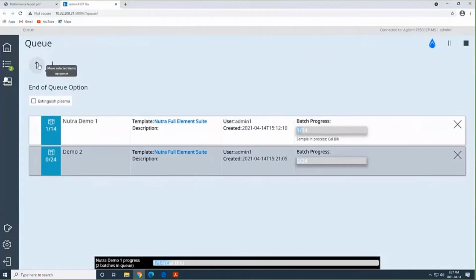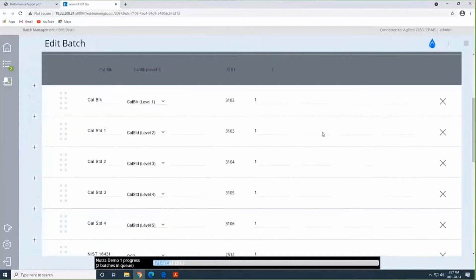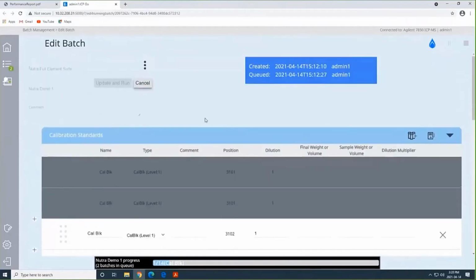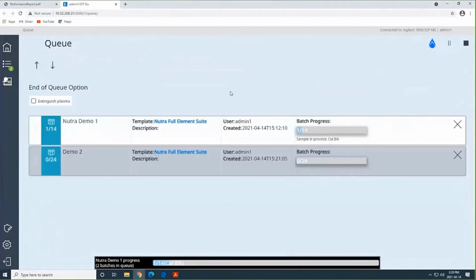So if you had multiple batches and you're in your office and you realize, oh no, that sample set that's fifth one down the line, I need to get that data out the door, you could position it up in the queue so that it's going to be run next. The other thing you could do is go in here and edit this sample table so that I can actually add new samples, so that those would be set up and ready to go, so that I can prioritize and make sure that I'm getting data done as quickly as possible in the best time frame.